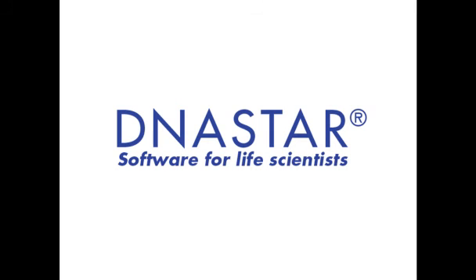So hopefully that gives you enough information as a starting place for performing your own RNA-seq analysis.